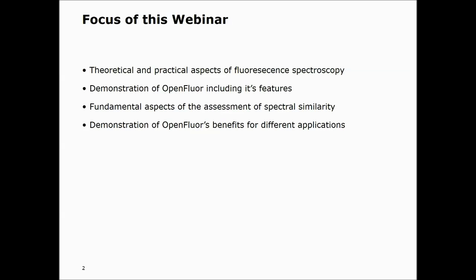Before we get started, I want to quickly remind everybody of the focus of this webinar. First of all, we're going to split it into 4 parts. First, we'll talk about the theoretical and practical aspects of fluorescence spectroscopy to have a common base to advance further into the field of OpenFluor and spectral matching.